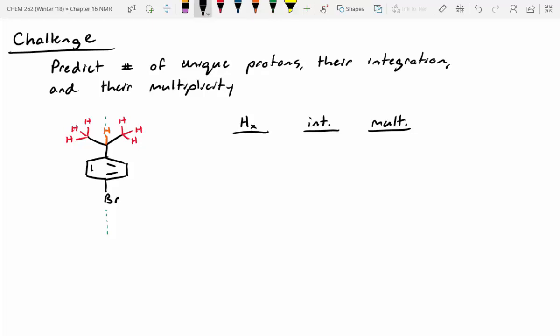All right, what about right there? No hydrogens, right? So we would ignore that one. Then I would say, all right, what about this one? Yeah, on the left-hand side, we must have an equivalent one. The tricky thing is the proton underneath, is it going to be equivalent? No, we don't have a horizontal plane of symmetry.